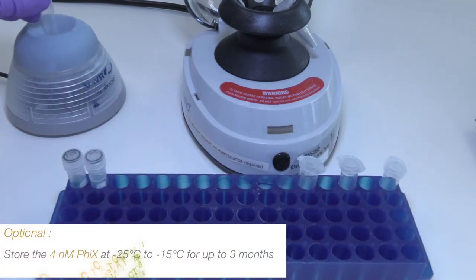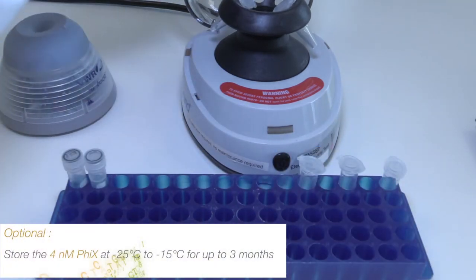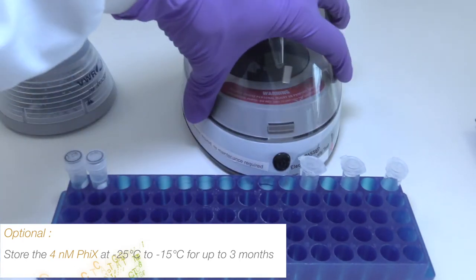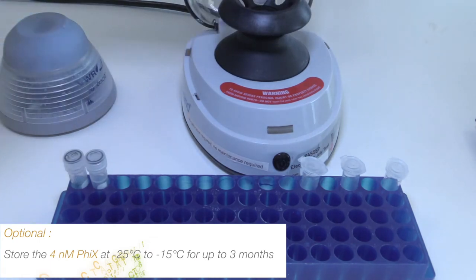Vortex briefly and then pulse centrifuge. You can store the 4 nanomolar Phi-X at minus 25 degrees Celsius to minus 15 degrees Celsius for up to three months.